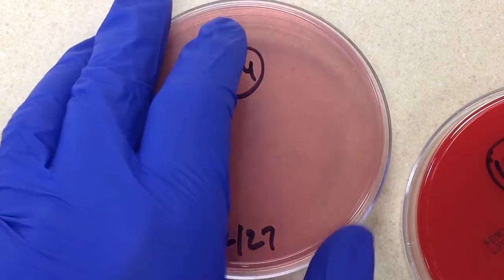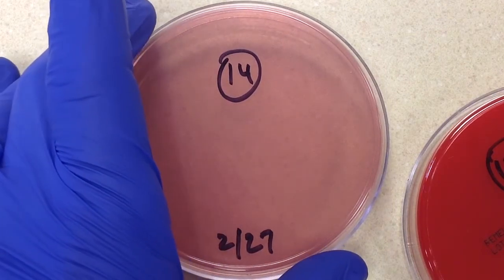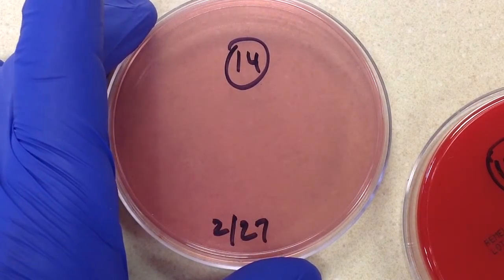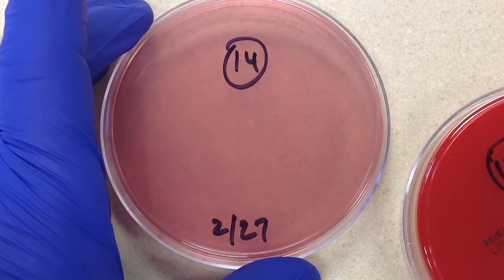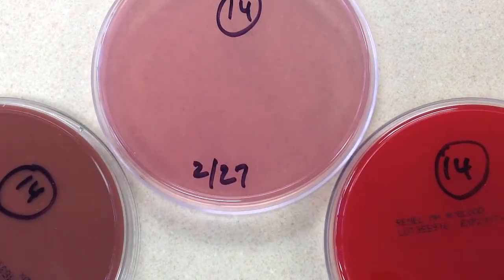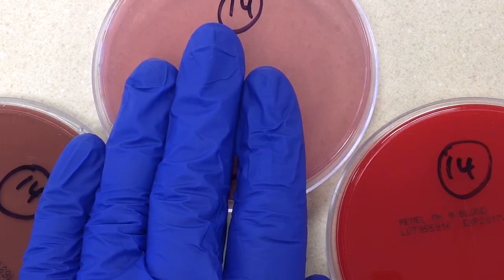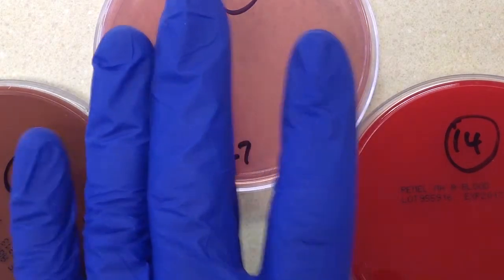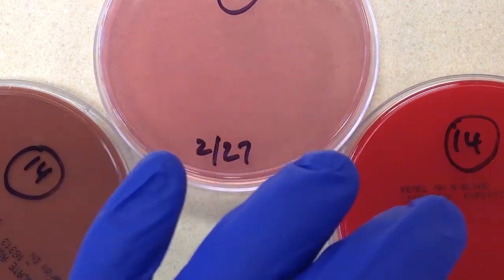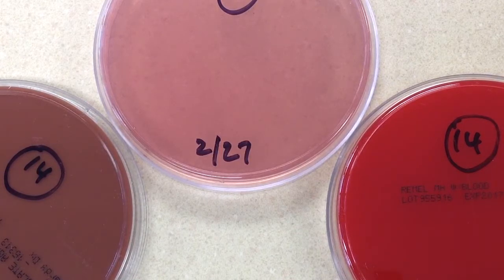Looking at the common pathogens that tend to show up in blood cultures: staph species, strep species, Enterococcus, Candida species (yeast), and members of Enterobacteriaceae — gram-negative rods. The fact that there's no growth on MacConkey's allows me to pretty much rule out Enterobacteriaceae. And since the gram stain yesterday showed gram-positive cocci in clusters, that's a pretty good indicator we're not dealing with yeast.